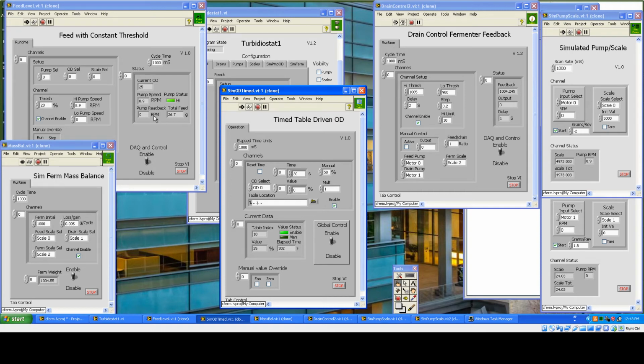There we go, 25, turns back on. We're running back here again. This here moving up, keep our eye on that. Once it passes 1005, we'll see the regulations start to kick in. There we go. Now here we're starting to move up.